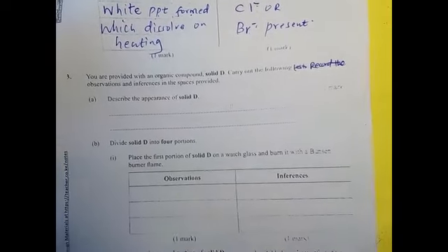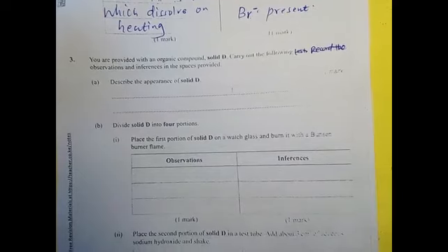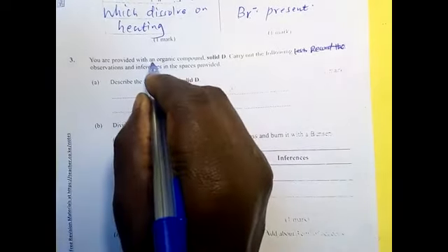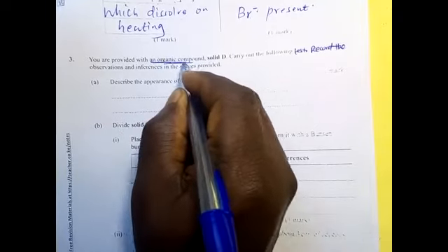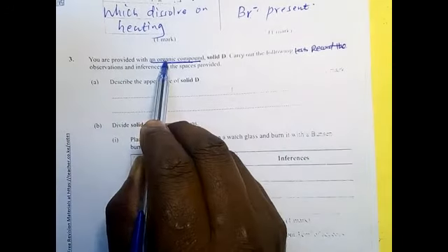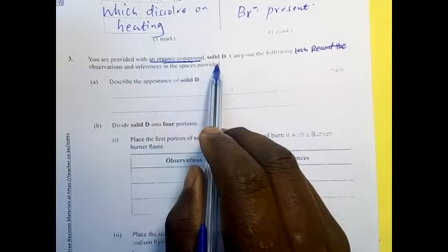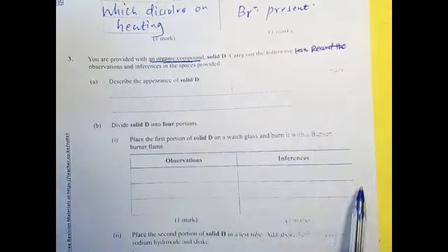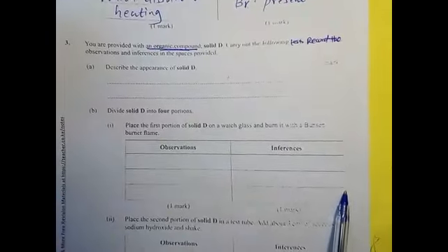Let us go to the last bit of it. You are provided with an organic compound. Very important. You have been told you are not going to find out whether it is organic. This one you have been given straight that it is an organic compound. So carry out the following test, record the observations and inferences in the space provided.